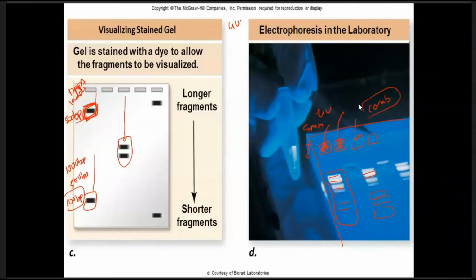It produces one strand on top and one strand at the bottom. The bottom one is the shorter DNA fragment, the top one is the longer DNA fragment, although both are of medium size. For reaction 3, the last one, it produces a short fragment and the top one you observe is the longer fragment. Reaction 3 is the one on the far right.